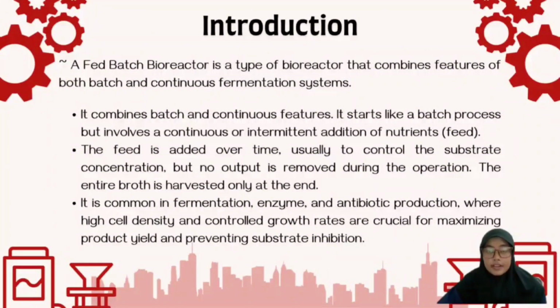However, as the culture grows, we begin a process of feeding. That's where the continuous feature comes in. It starts like a batch process but then involves a continuous feed. The feed is added over time, but no output is removed during the operation.